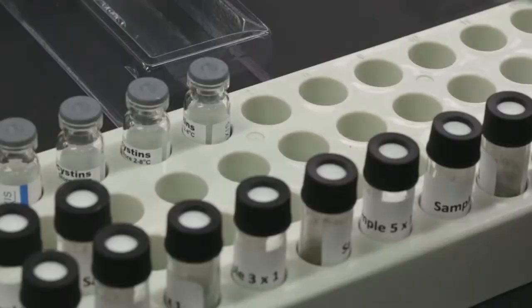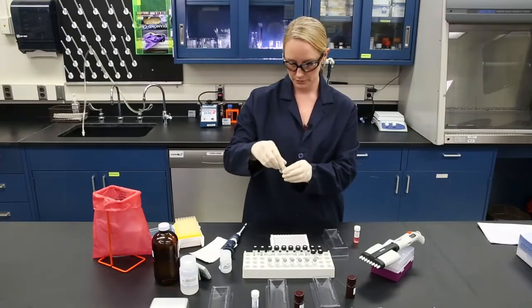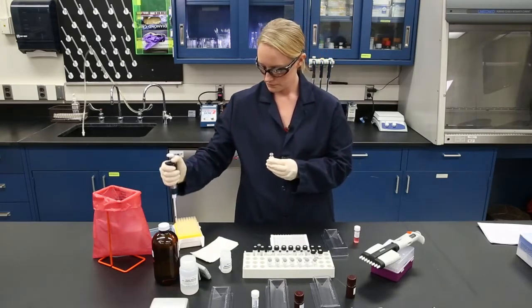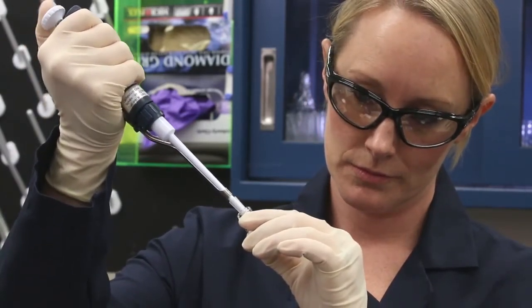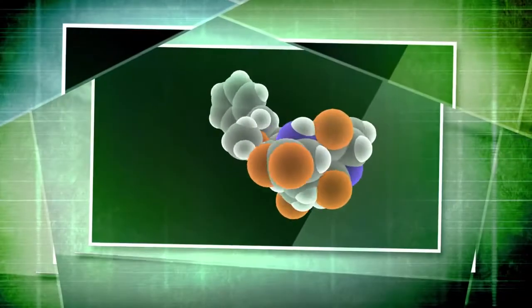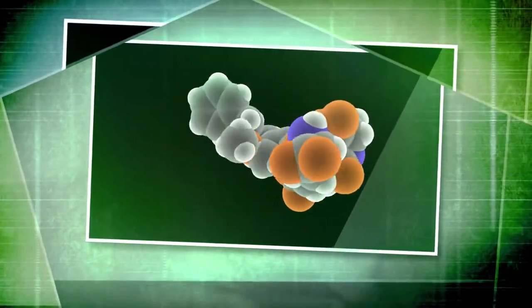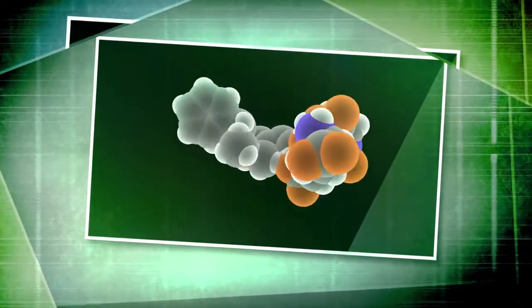We're going to demonstrate how to measure a particular group of toxins following the Ohio EPA Total Microcystin Analytical Methodology using an ADDA ELISA kit. ELISA stands for Enzyme-Linked Immunosorbent Assay. The acronym ADDA refers to a part of the microcystin molecule that, when measured, serves as an indicator for the majority of the various microcystin variants, or congeners.